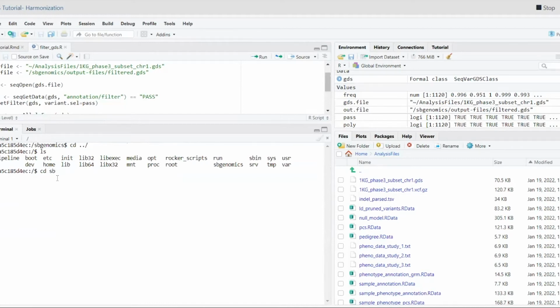this folder structure, and everything under SB Genomics is important. So we have all of our project files. So if you have hosted TOPMed data, and some of it's open. So these are NHLBI, sorry, the TOPMed data is not open. You need to have the dbGaP permissions attached to your eRA Commons ID, but you can also access open datasets such as BioLink and 1000 Genomes, which I want to show you here.